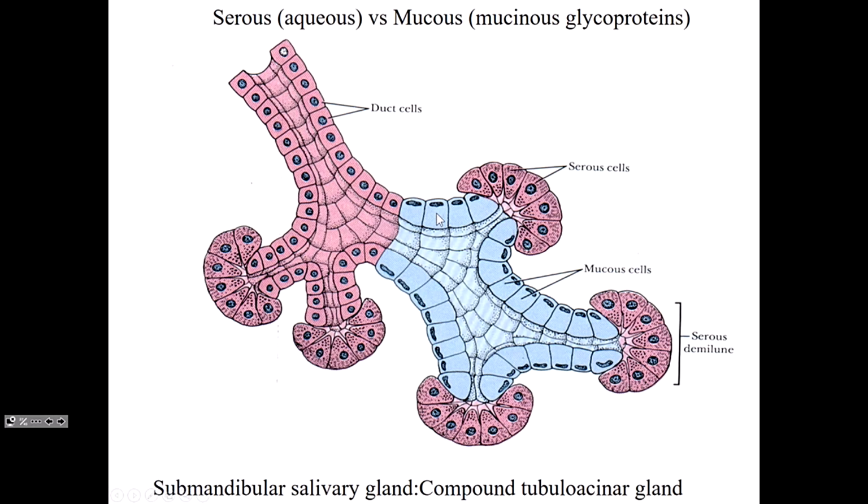It's usually a light colored goop, yellowy light goop, not very dark, right? So that is typical of a mucus secreting cell. They're secreting these mucopolysaccharides, which have a lot of sugar residues, saccharides in there, which doesn't stain very well. So they typically stain quite lightly. So that would be a mucus secreting cell.